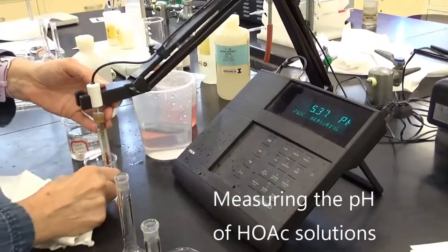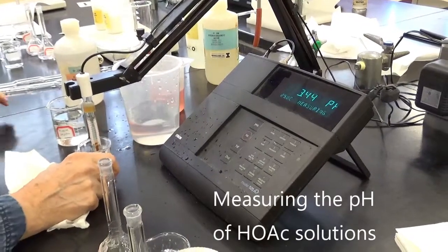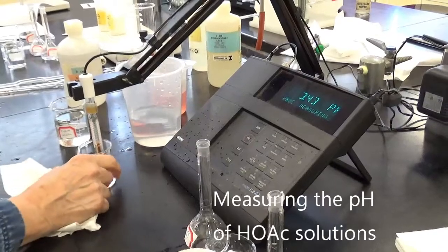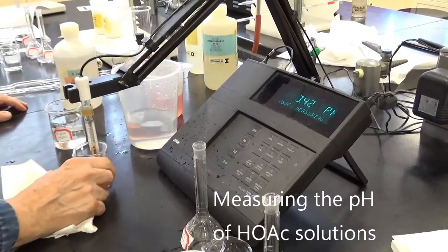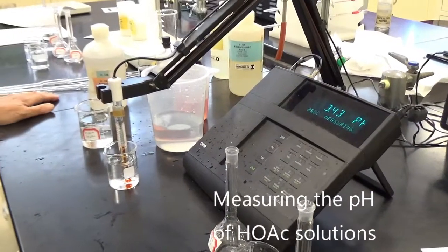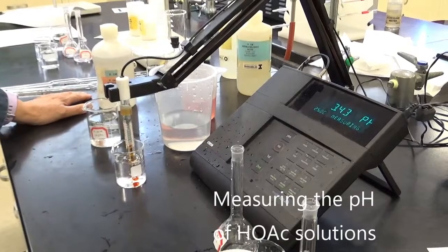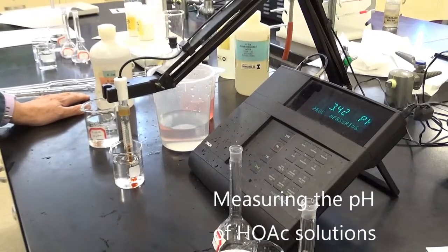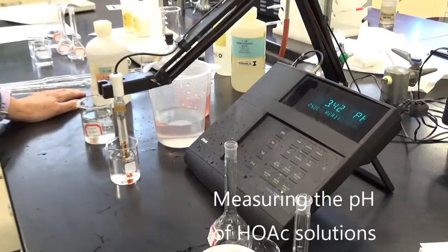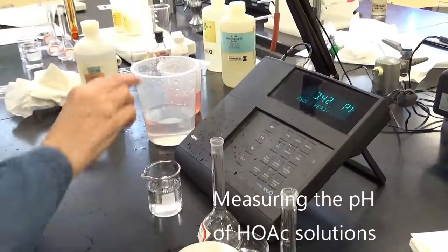Second one. First dilution. Well, let's see if we can get a beep here. Looks like it's pretty steady at 3 point, oh, it just changed a little. Did you hear a beep? Yes. 3.42. Okay. Rinse it again.